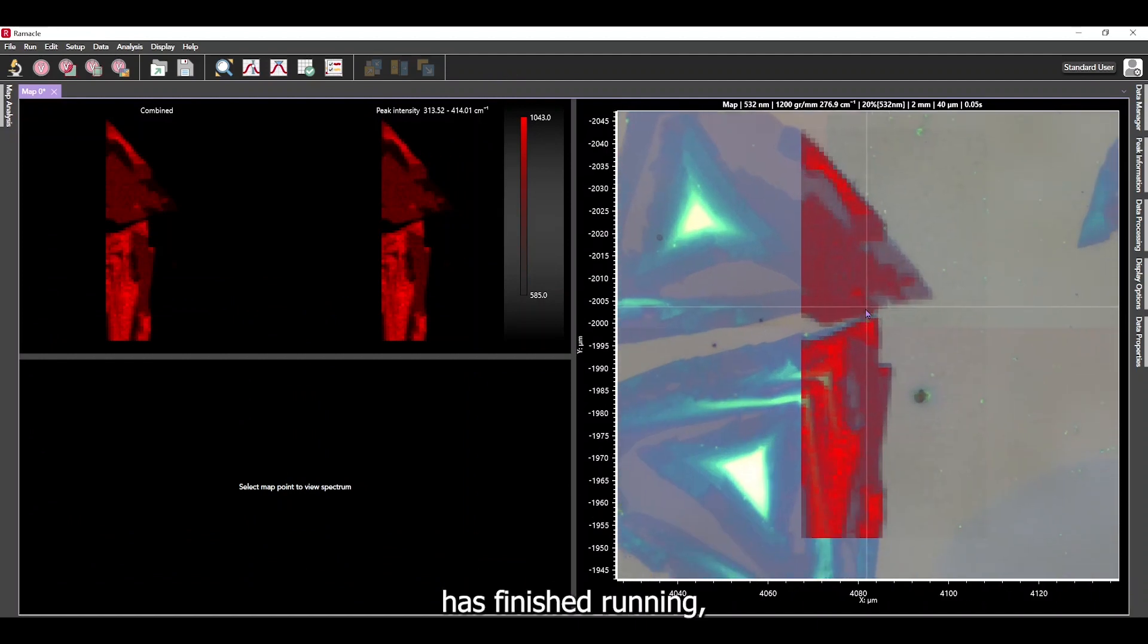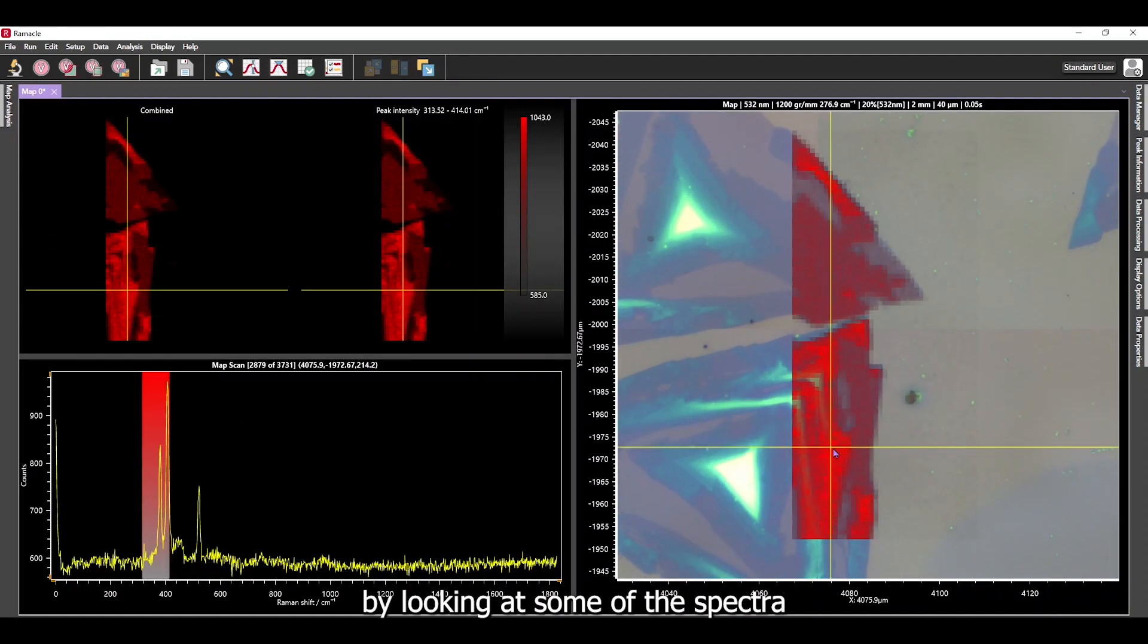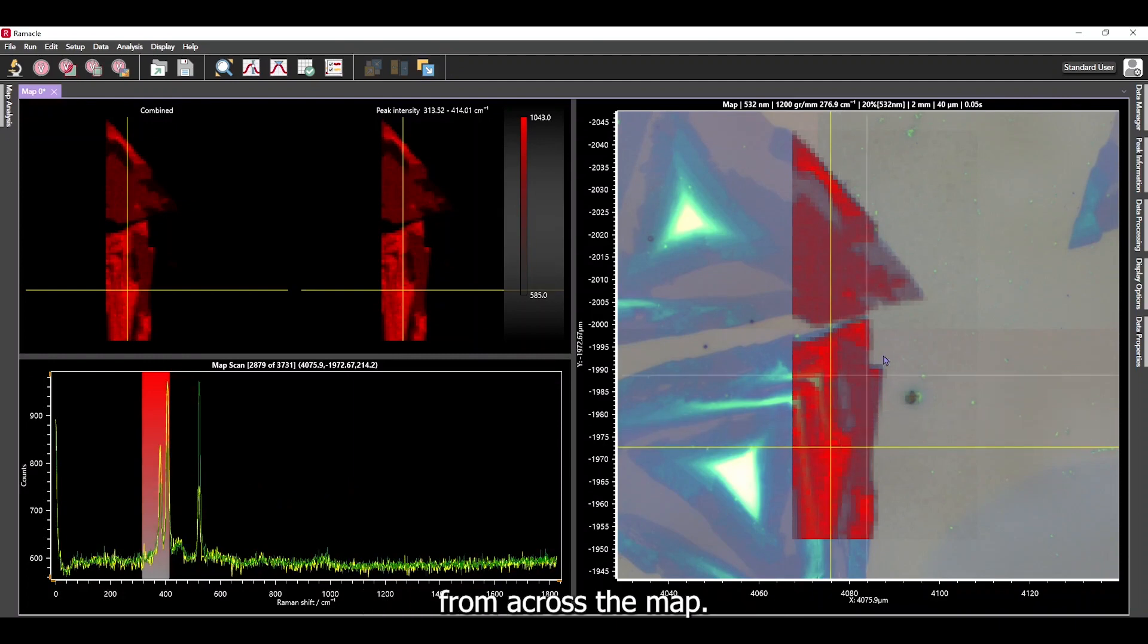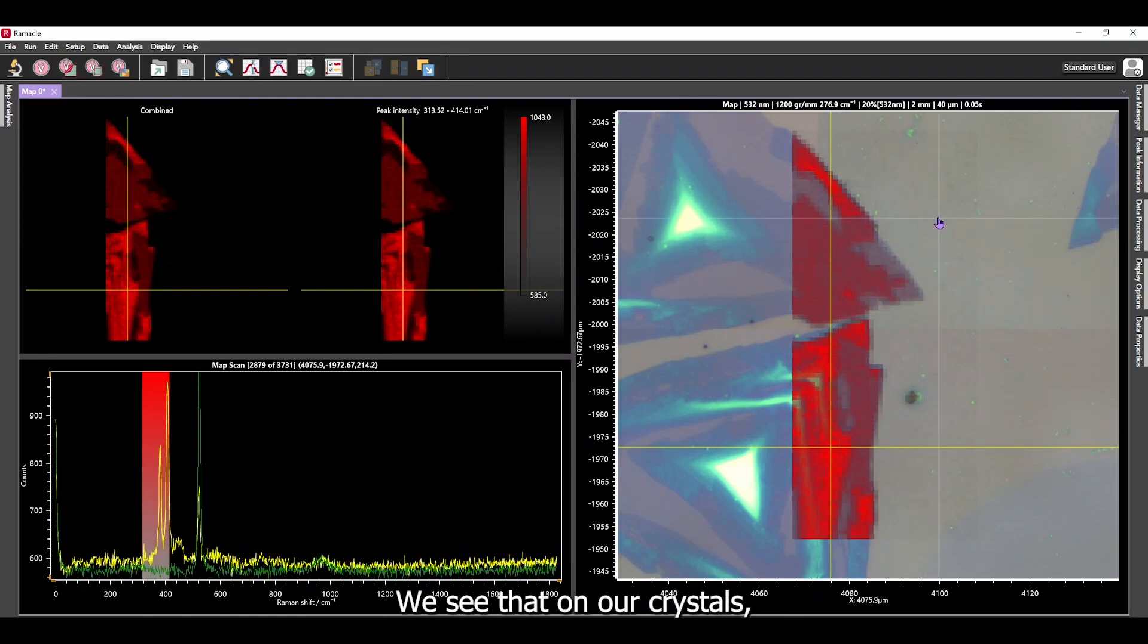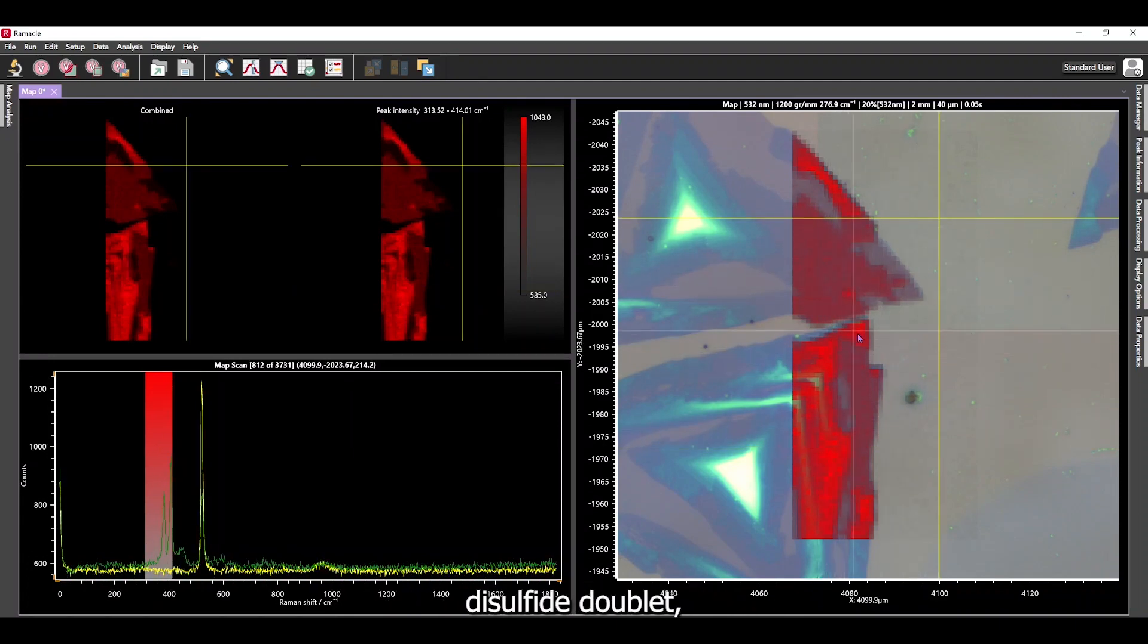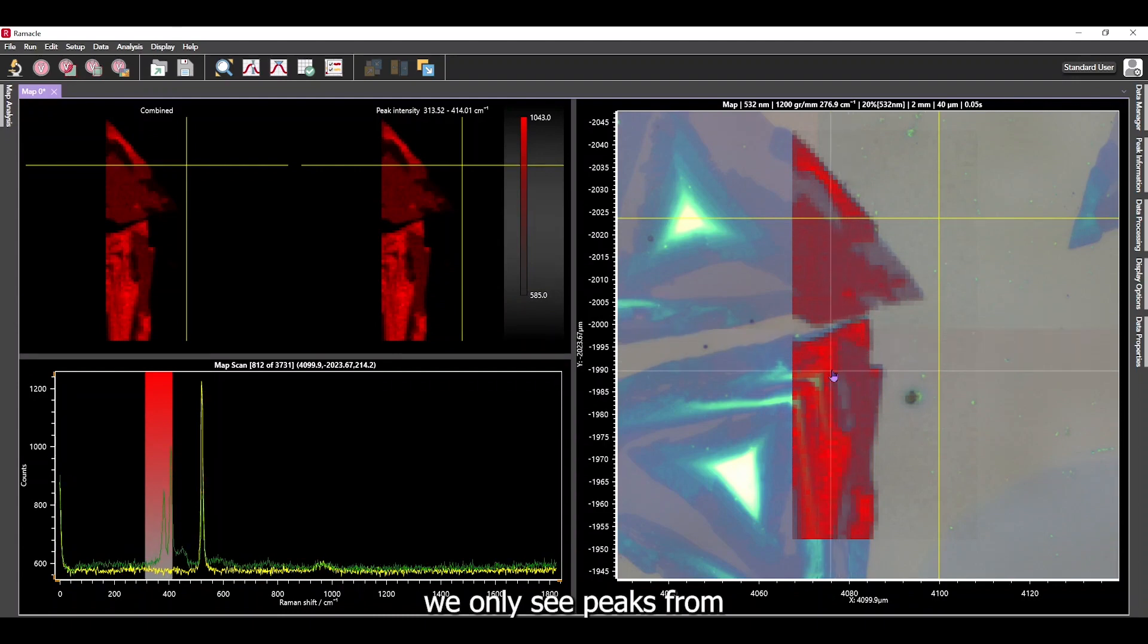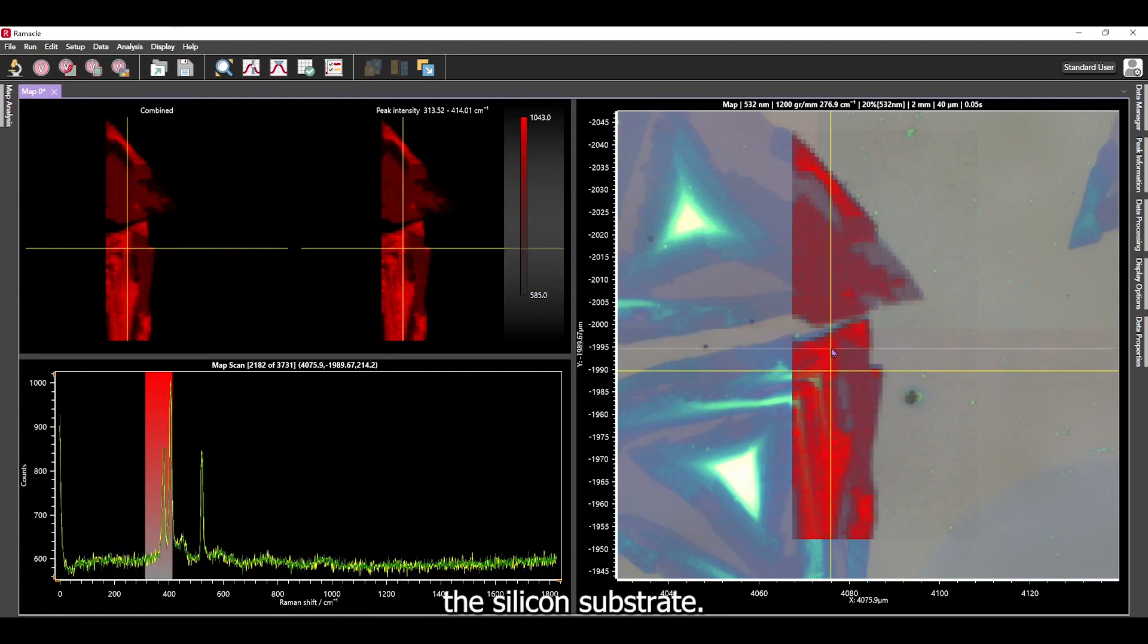Now that our map is finished running, we can analyze it. Let's start by looking at some of the spectra from across the map. We see that on our crystals, we have the molybdenum disulfide doublet, and off the crystals, we only see peaks from the silicon substrate.